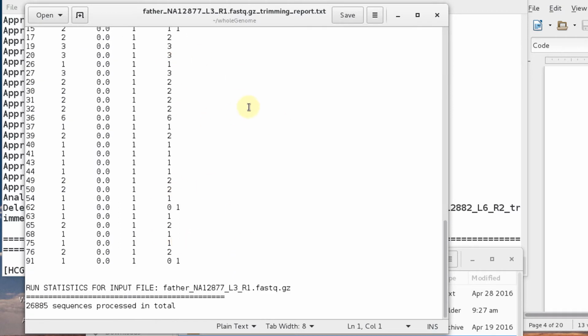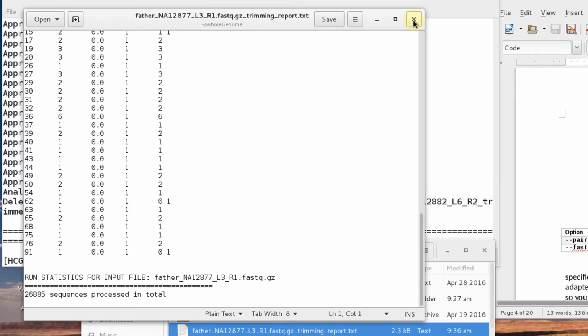So this gives you a good sense of how contaminated there were of primer adapters. We only looked at primer adapters, but you can also come in and say remove the last so many bases from the 3' end, or remove the bases from the 5' end, things like that. So look at the Trim Galore manual to understand what you can and cannot do with that tool set.